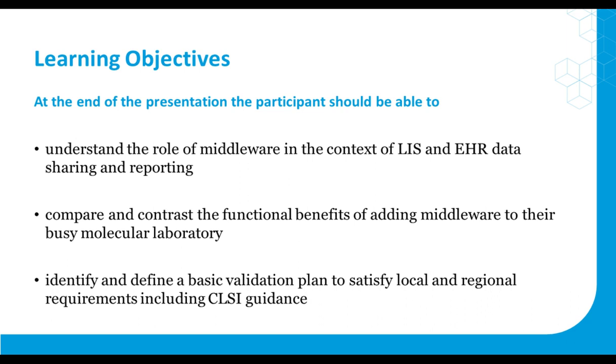At the end of this presentation, it's my hope that you'll understand the role of middleware in the context of both laboratory information systems and the ever-evolving EHR, the data sharing and reporting process. It's also my objective that you're able to better compare and contrast the functional benefits of adding middleware to a busy molecular lab. And last but not least, it's really about helping you identify and define a basic validation plan that satisfies your local requirements.